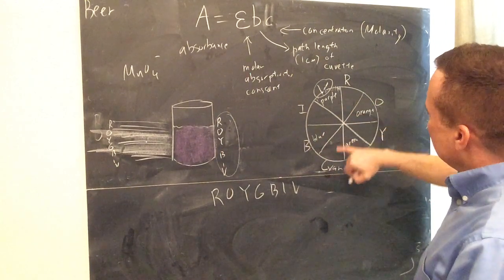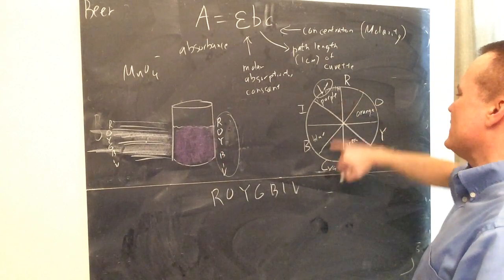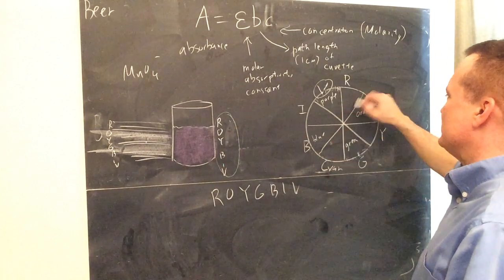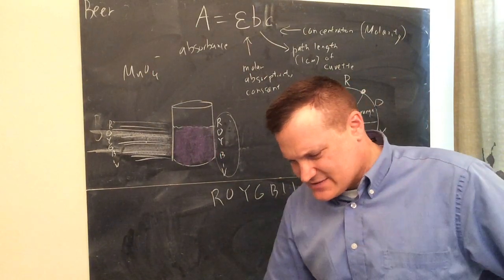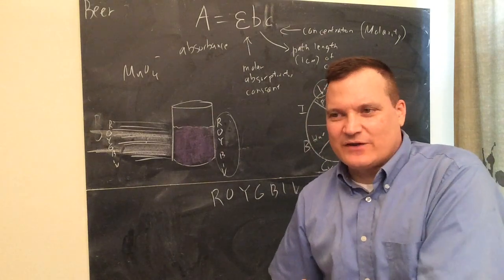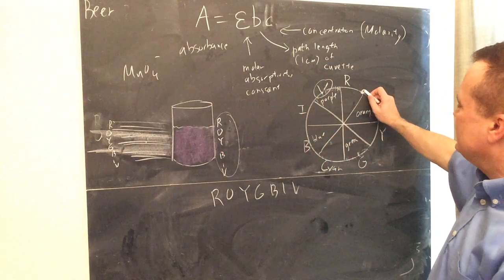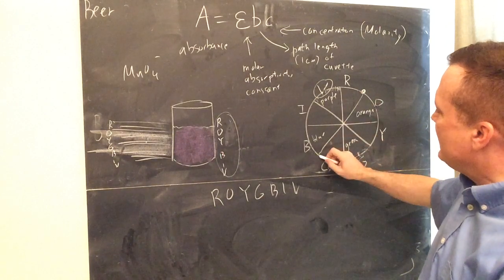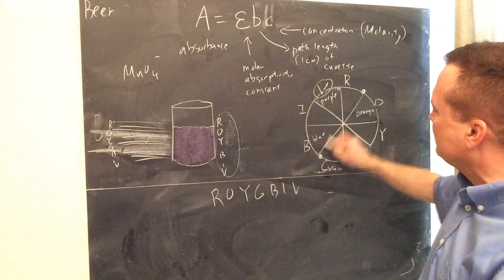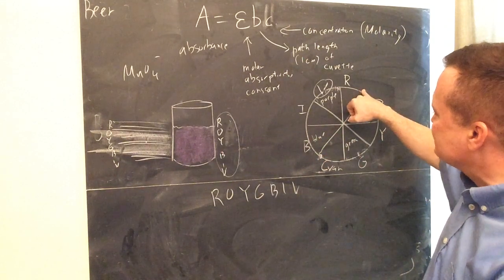Now red, opposite red is cyan. It can also be kind of a blue. I mean, like I said, it's a bluish color. I mean, there can be a red light. In fact, I think I did one of these in the AP Readiness. I did one of these at UCLA. Maybe you saw that one or not, but I had a red material, cobalt, and so the light I had to shine through it, the closest one was like a blue color because it's really close to being blue. I mean, red and blue almost. It's a type of red.